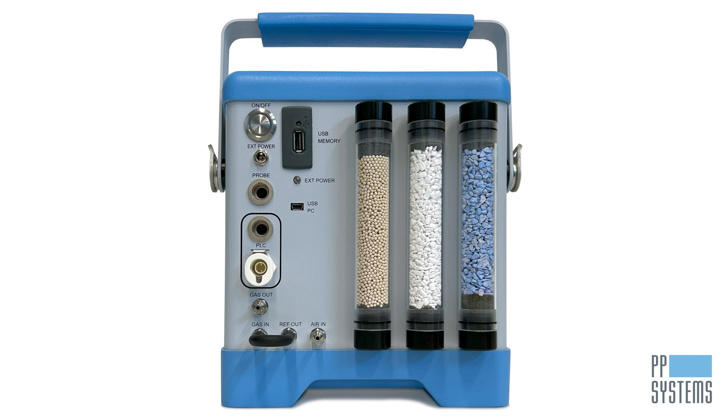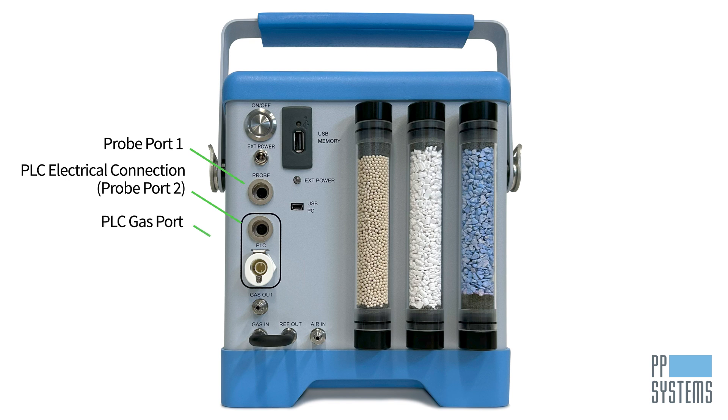Two probe ports are available for powering chambers and sensors simultaneously, depending on the sensors chosen, as well as a PLC gas port to connect the leaf cuvette, providing both the supply or reference air and the analysis or sample air.